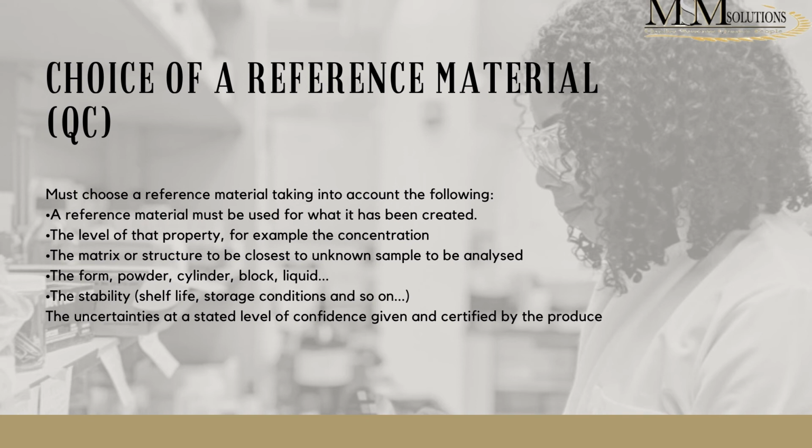So that is all the information that you need to look at and say, okay, this will work for my analysis because it is at the same level as what I need to analyze. It is in the same structure, it's been prepared the same, it's stable, I can use it for longer, and the uncertainty given is also within my acceptable quality limits.